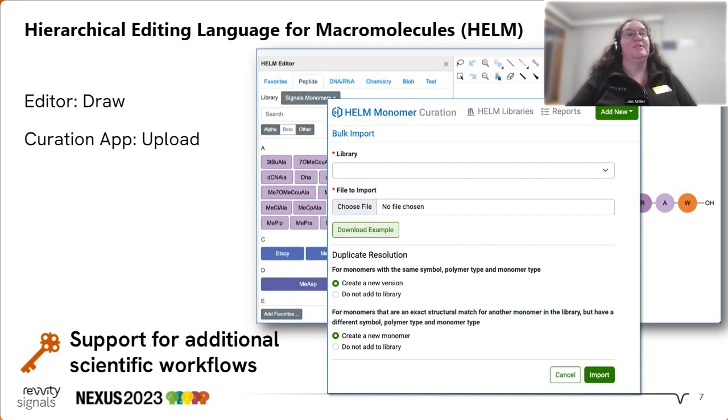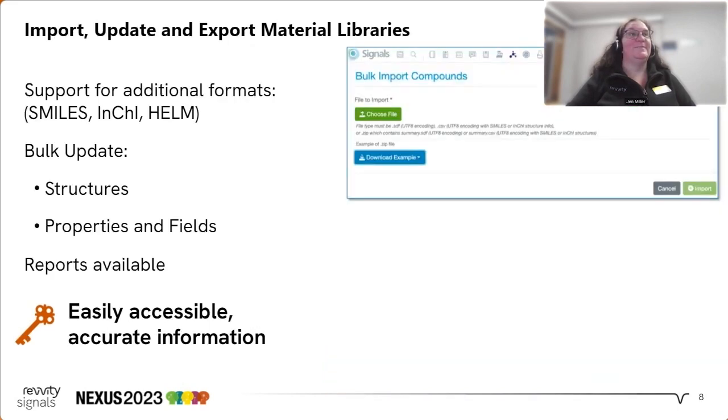This library is a great illustration of how working together we can expand the capabilities of the Materials Library to support the large molecule workflows. We partnered with customers, external folks, and our own internal experts to bring this next-gen large molecule library to life. For more details about any of these features, please see Dan Weaver's talk in the Life Sciences track.